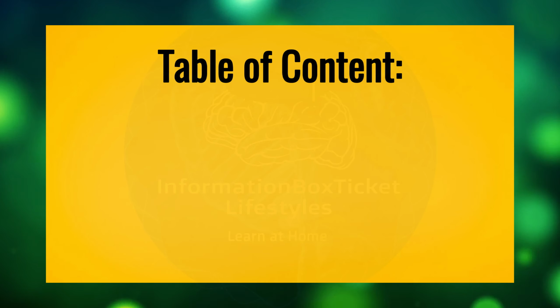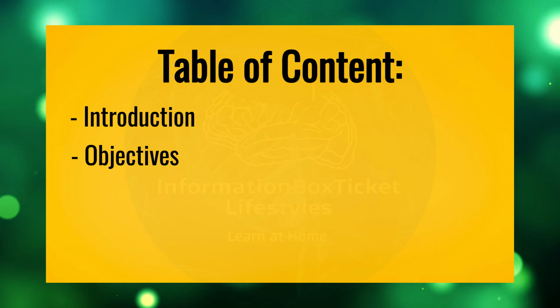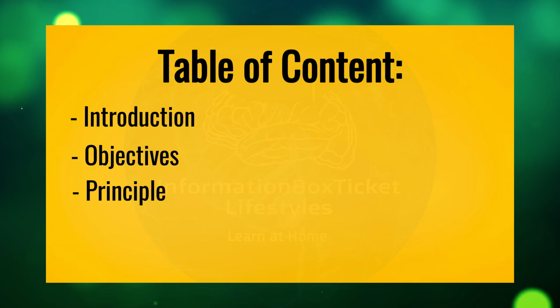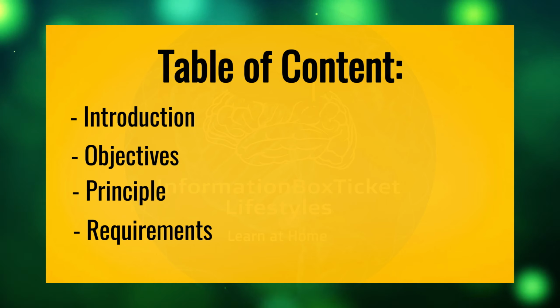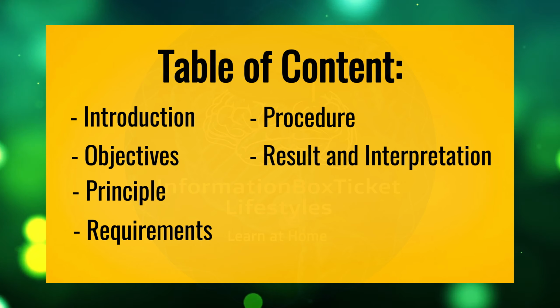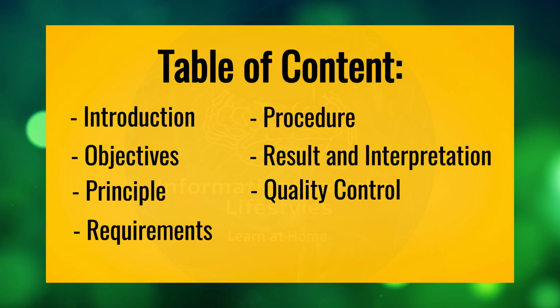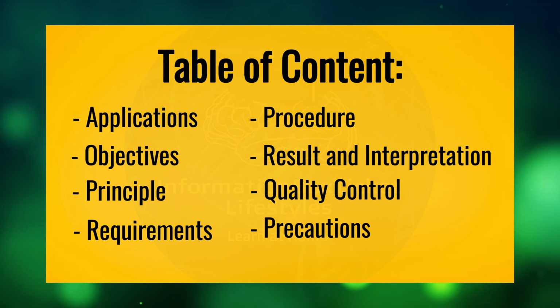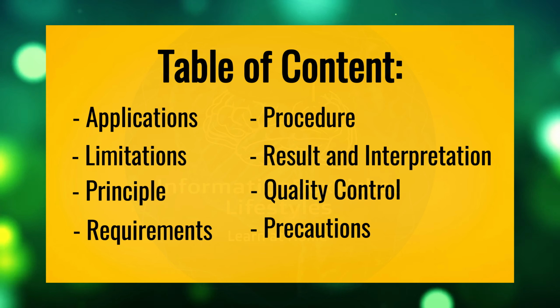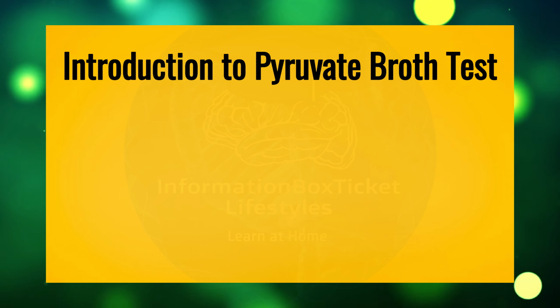Table of contents. Introduction of Pyruvate Broth Test. Objectives of Pyruvate Broth Test. Principle of Pyruvate Broth Test. Requirements for Pyruvate Broth Test. Procedure of Pyruvate Broth Test. Result and interpretation of Pyruvate Broth Test. Quality control. Precautions. Applications of Pyruvate Broth Test. Limitations of Pyruvate Broth Test.